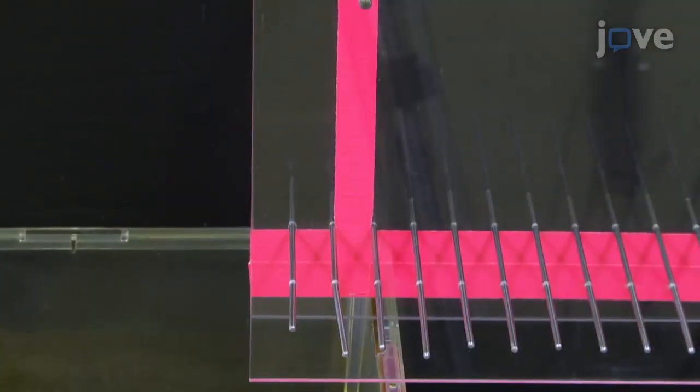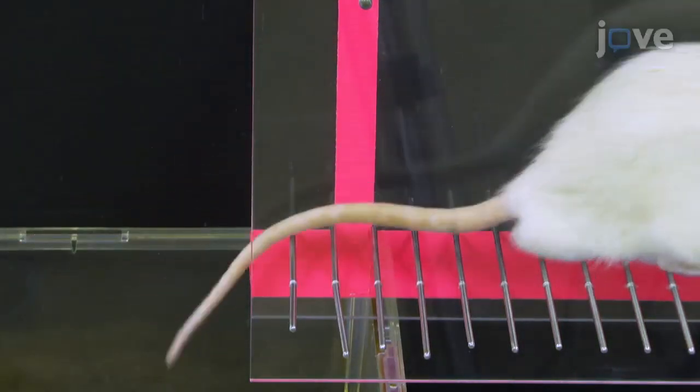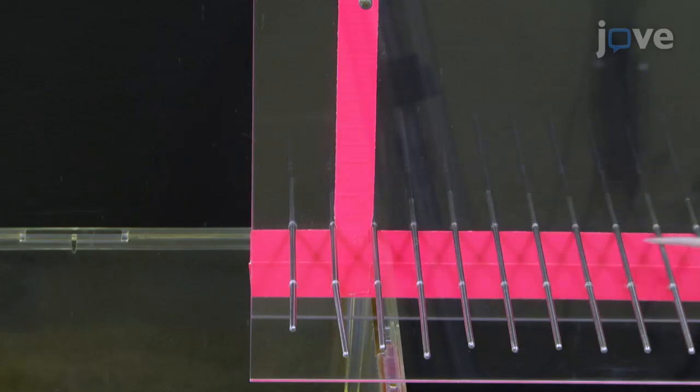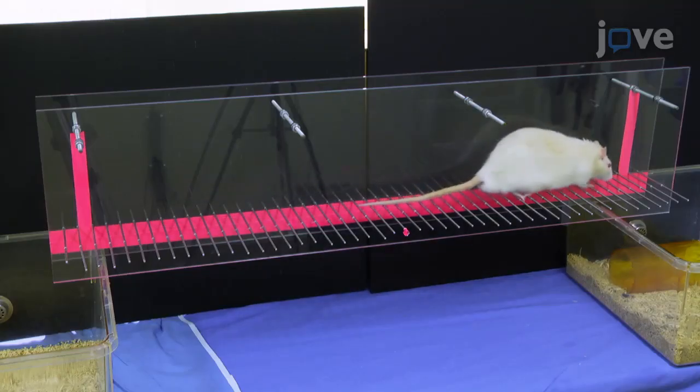Start the video recording and allow the animal to begin the run by holding their front paws over the first rung of the ladder. Allow the animal to move onto the ladder unassisted, and from the start line to the finish line at their own pace while filming.